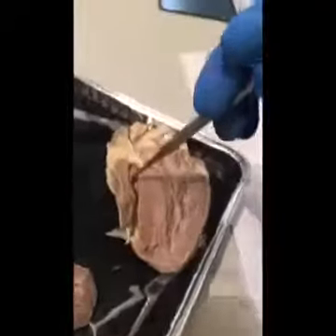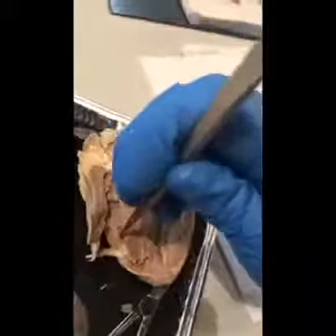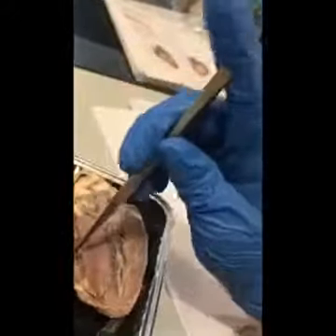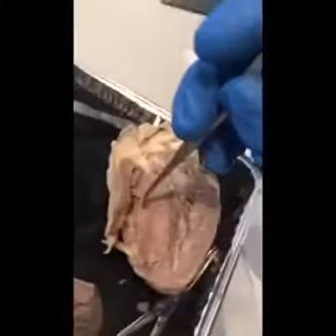We then go down the tricuspid valve and past the chordae tendineae and the trabeculae. After that, after we pass through the valve, the right AV valve will shut, and then we will head to the pulmonary artery through the pulmonary semilunar valve.